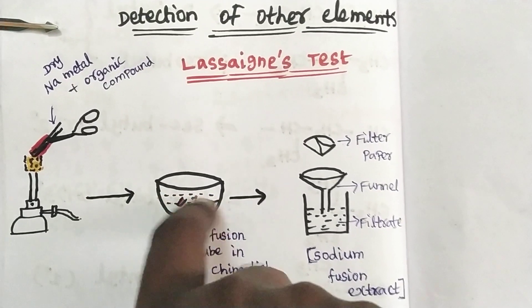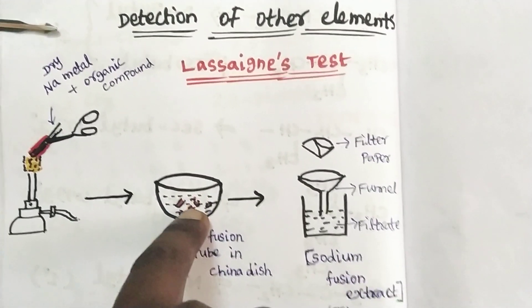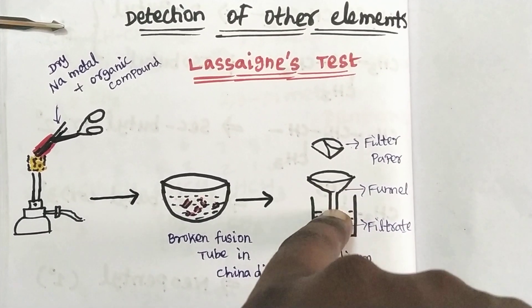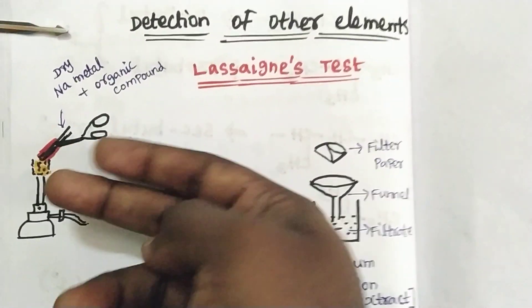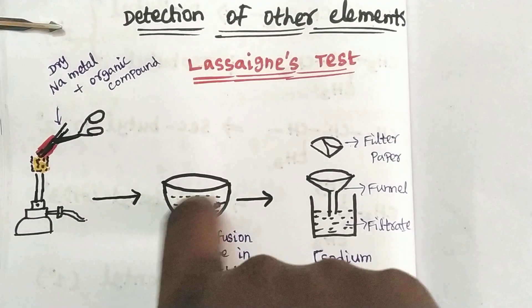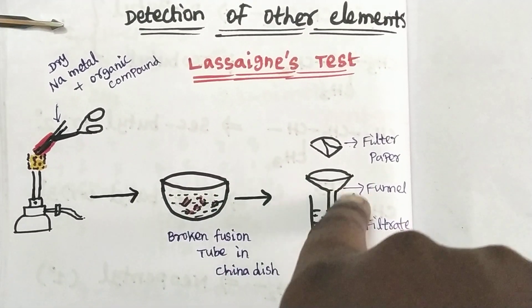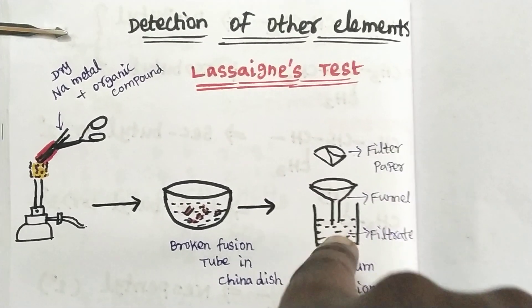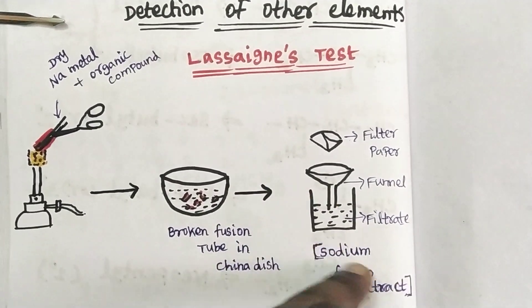Once the tube is red hot, we plunge it into a china dish containing distilled water — about 50 mL. We crush the tube and put a filter on the beaker. There is a filter paper placed on a funnel above the beaker. We filter the liquid, and the filtrate obtained is the sodium fusion extract.